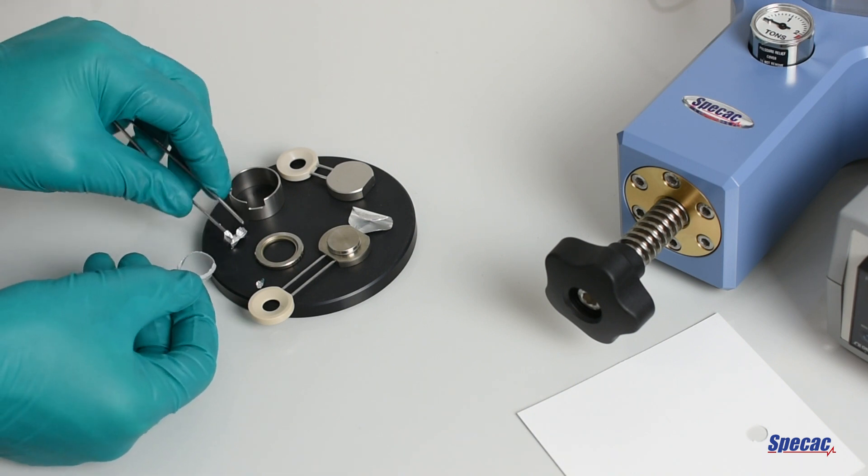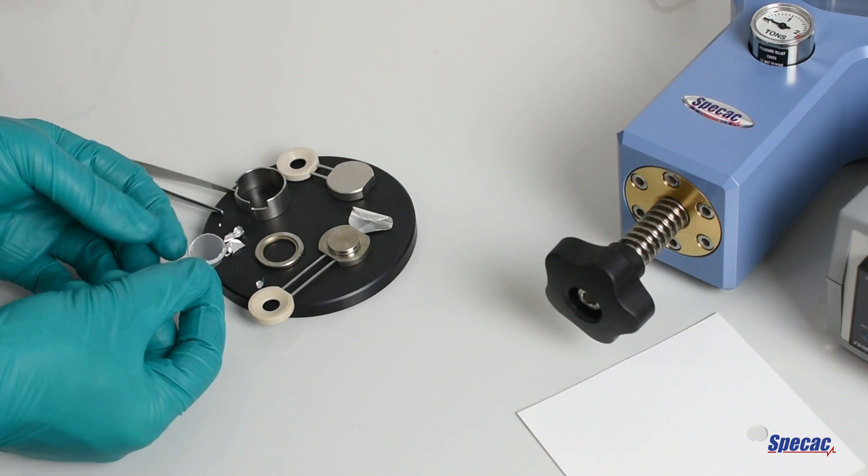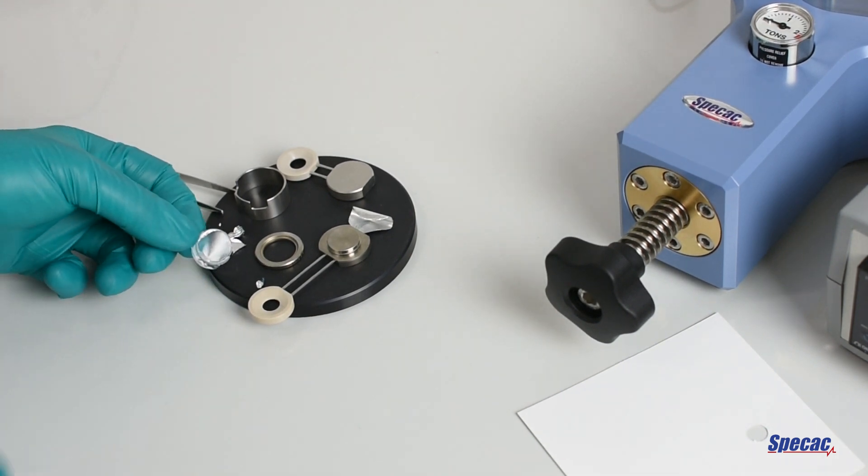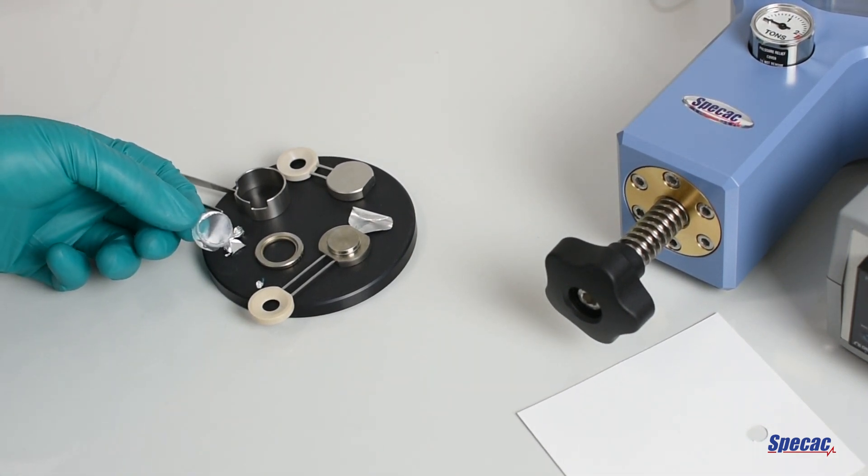When the aluminum foils have been removed, a thin film of approximately 15mm in diameter, and of a thickness corresponding to the sizing ring, will have been produced.